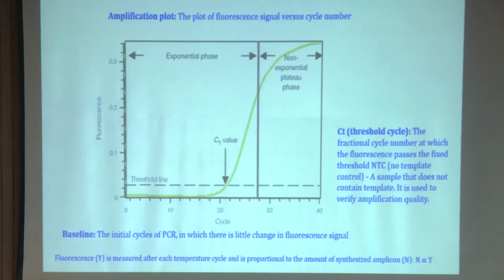You put C first and then T as a subscript, like CT, we call it. Some of the companies also use quantification cycle, CQ. So that also I will introduce to you.